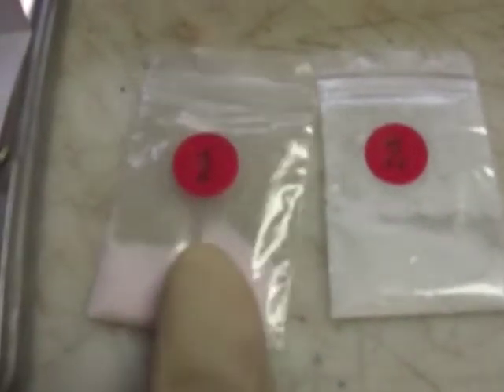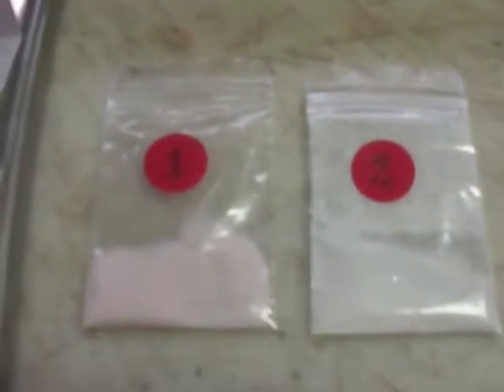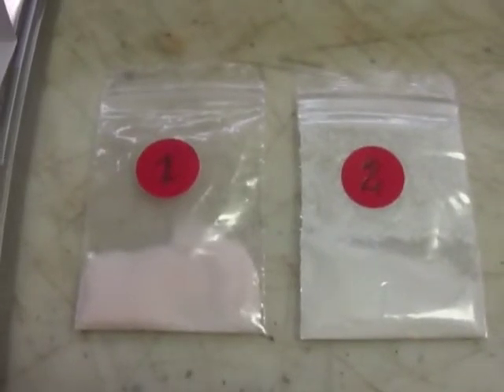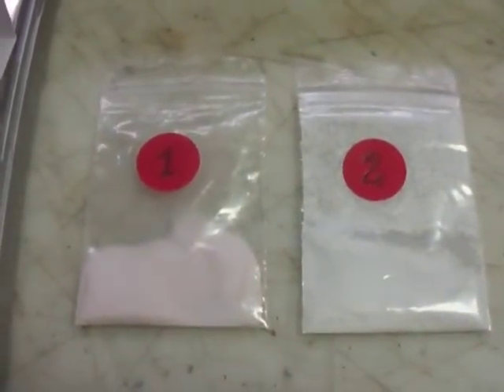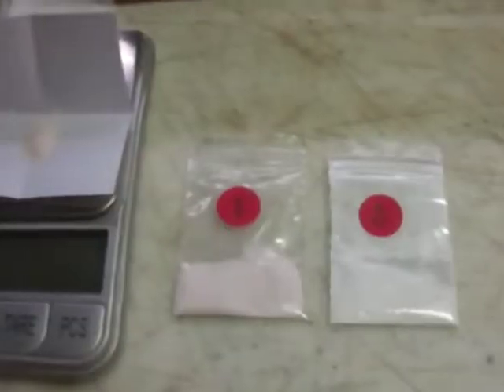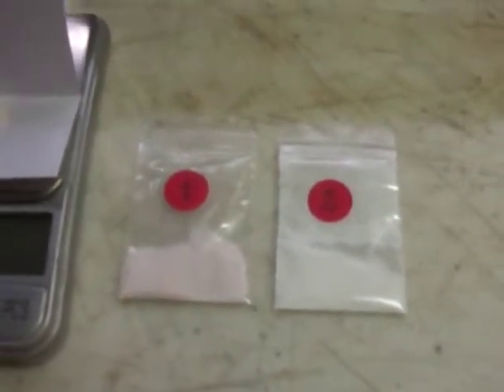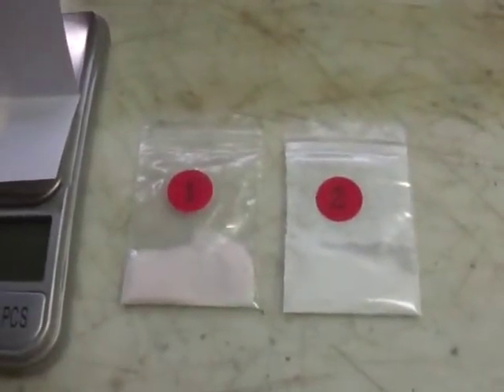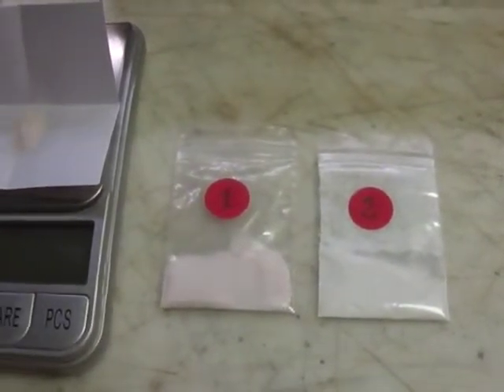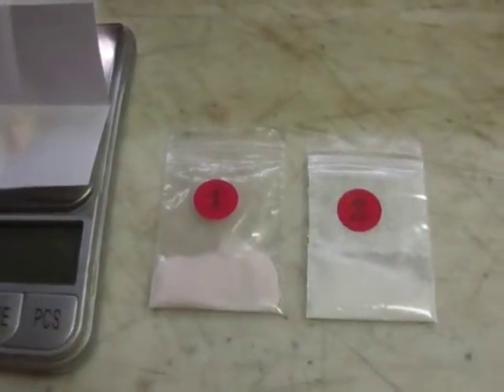The one on the left, which is the salt I'm looking at, definitely has a pink color, so I don't know if you can pick that up on the camera. So that kind of also supports the possibility that it might be a manganese salt. The procedure actually calls for dissolving the volume of equal to 2 drops, and I don't know where in the world they got that. Trying to convert that to a solid is a little bit difficult because I don't have anything that measures in drops for a solid, like a spoon.